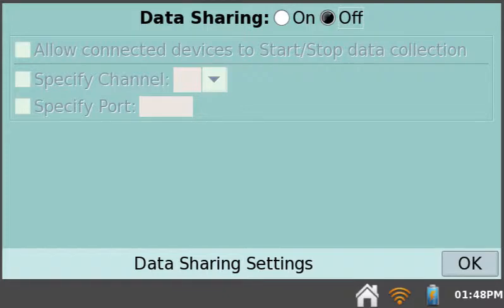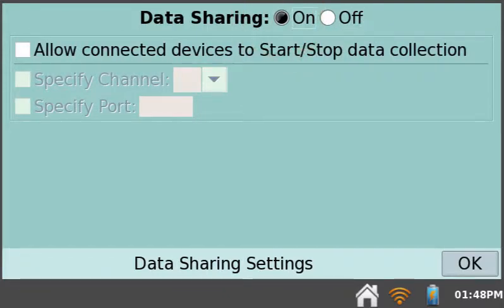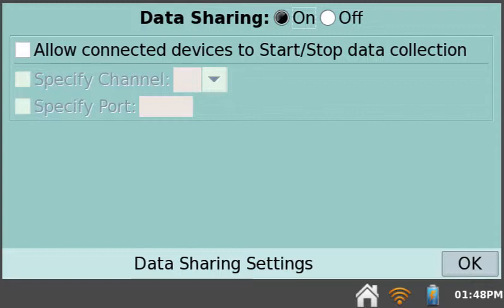Make sure Data Sharing is on. If you'd like to be able to start and stop data collection directly from the mobile device, make sure this option is enabled.